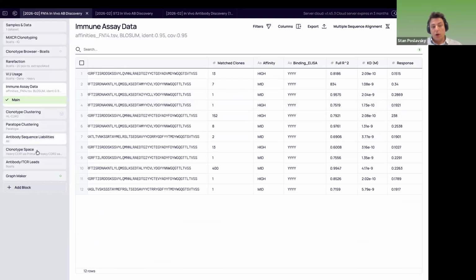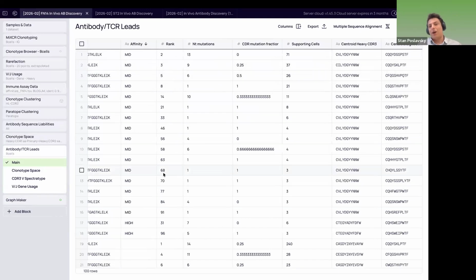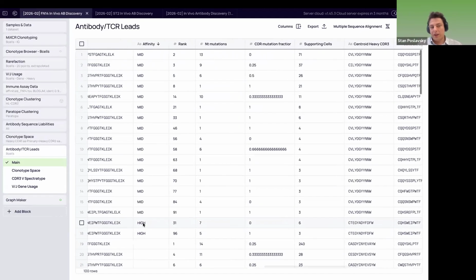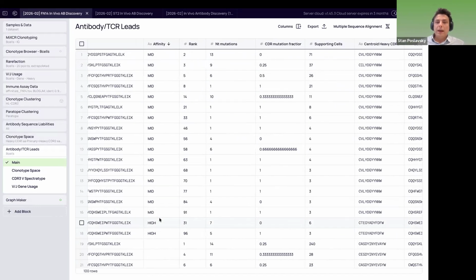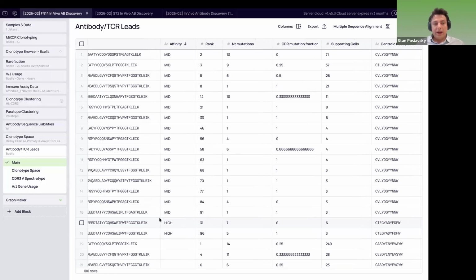So actually, what we did here, we selected those clones that were tested in this specific study with the ELISA assay. More or less, that's how it happens very, very often. You pick the top candidates and you test them, and that's what actually happened in this specific study. It turned out that the candidates that were picked are the most abundant ones.